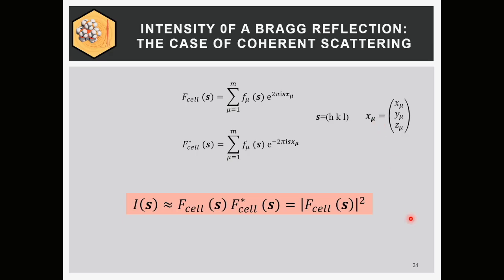And it would be great if we would measure the structure factor, the amplitude, we could relatively easily get the positions out of this. But unfortunately, what we see if we do diffraction is not the amplitude, it's the modulus of the amplitude squared, or in other words, it's the complex amplitude multiplied by the complex conjugate, which is given down here. And therefore, this information gets lost.